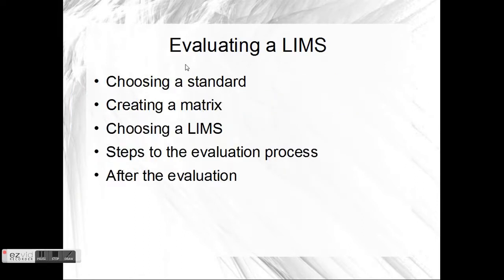So here was what we're going to talk about today. Choosing a standard, creating a matrix, choosing a LIMS. Steps to the evaluation process we'll talk about at another point in time, and the same with after the evaluation.